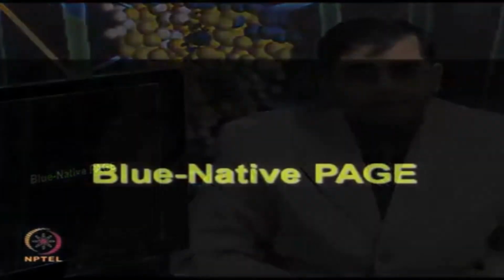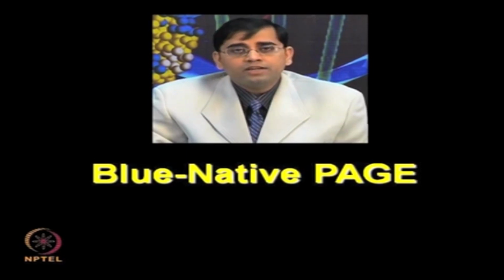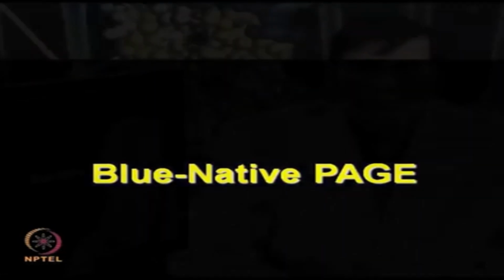So, let us now move to a variation of SDS PAGE known as blue native PAGE, blue native polyacrylamide gel electrophoresis. In SDS PAGE, we are providing a denaturing environment. We want to denature the protein, whereas in blue native PAGE, we want to separate the proteins in their native condition.